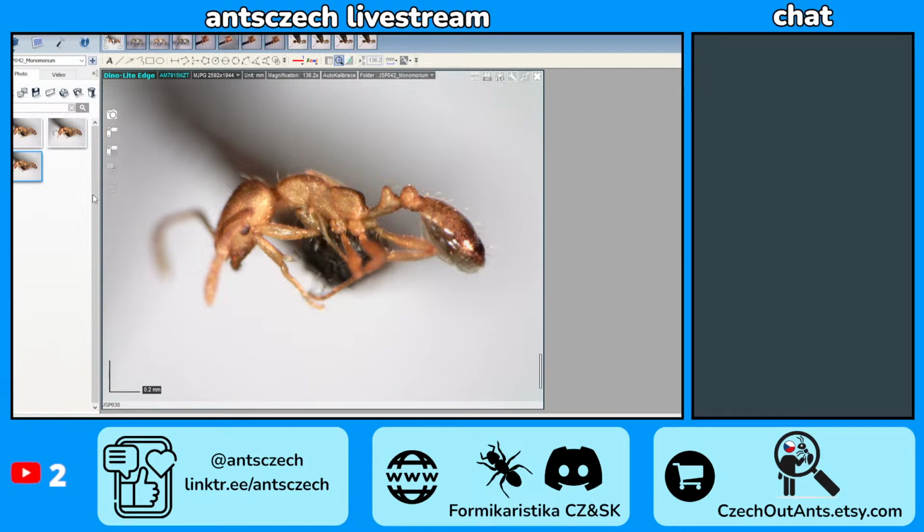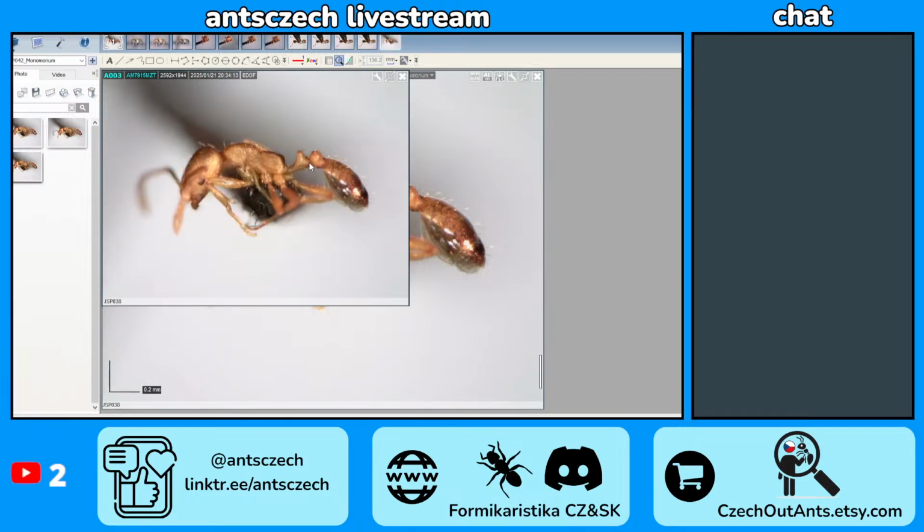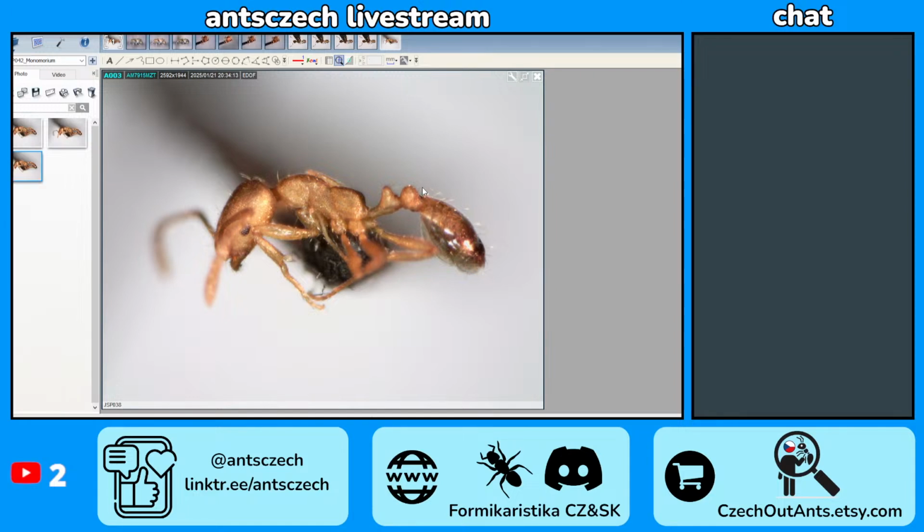Sometimes you need the petiole, sometimes the head. Generally I try to move the legs down so that the whole body except the legs is visible. Sometimes the pubescence on the legs is needed, but generally if I don't know what I will need, then I try to have a clear view of the whole body.